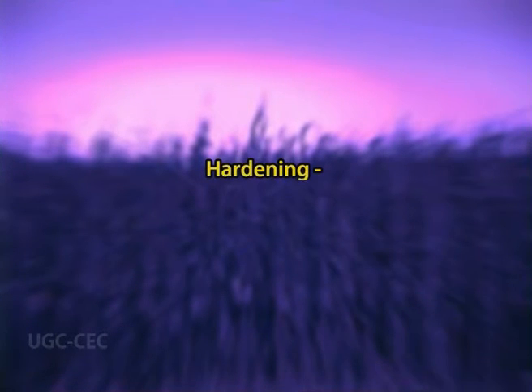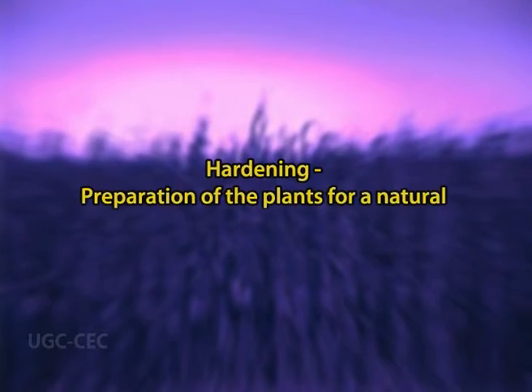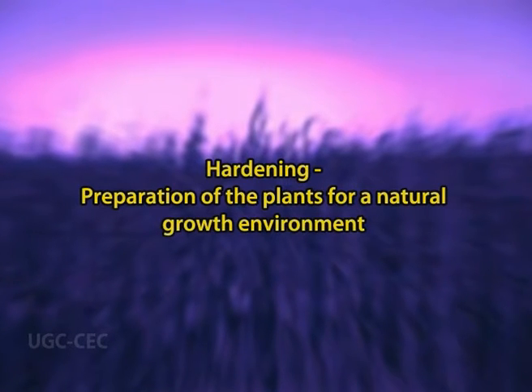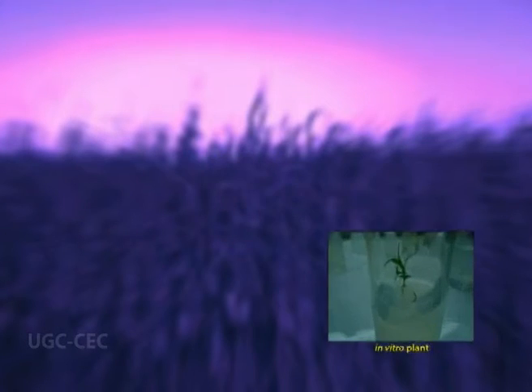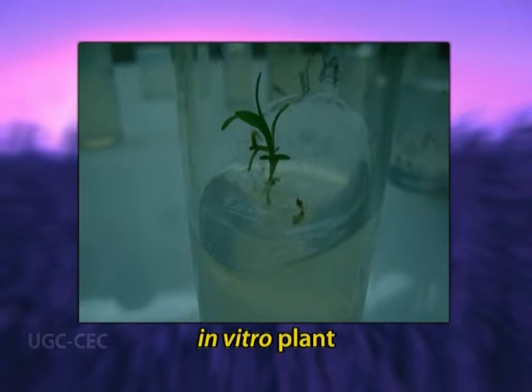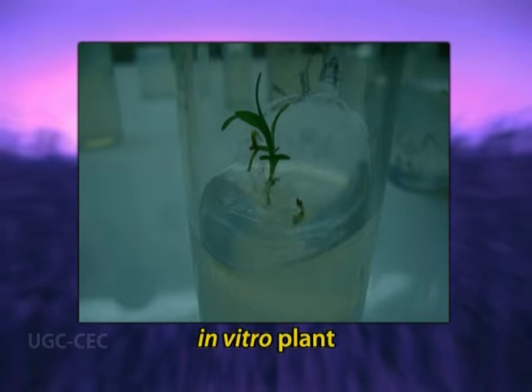The next important step of plant tissue culture technique is hardening or acclimatization. Hardening is defined as preparation of the plant for natural growth environment. In vitro conditions are high in humidity, and so the plants often lack a working cuticle and stomata that save the plant from drying out.